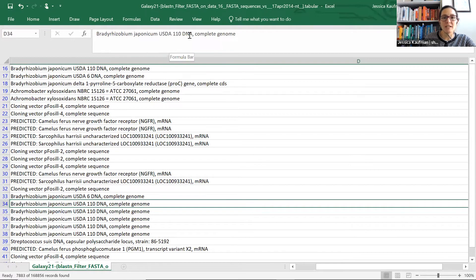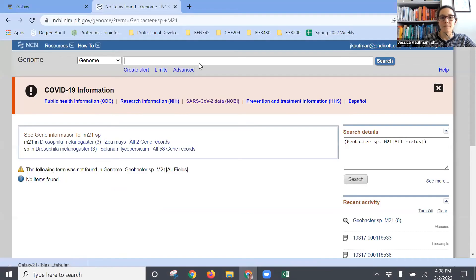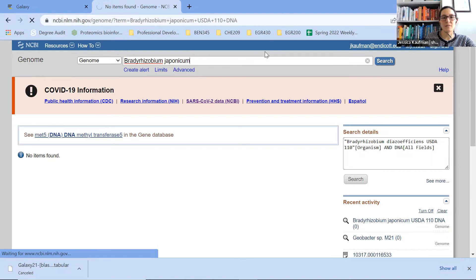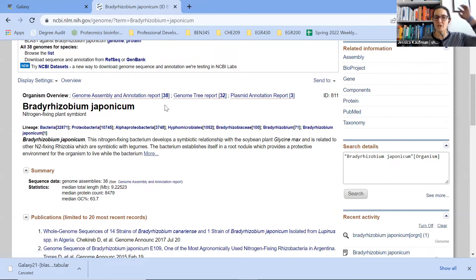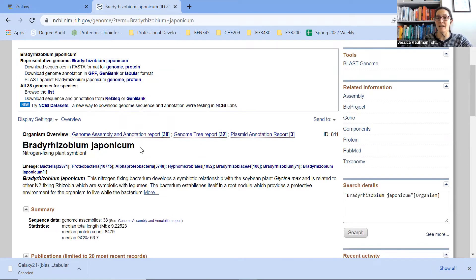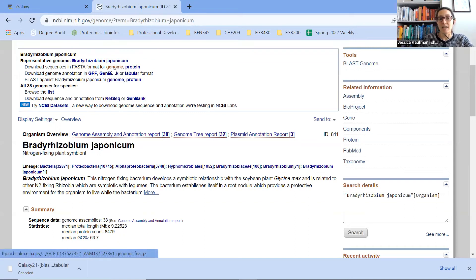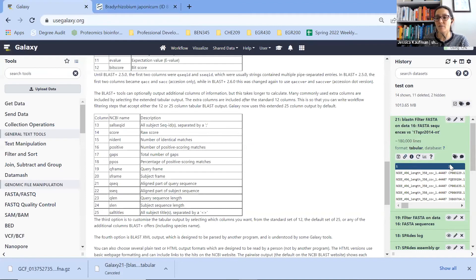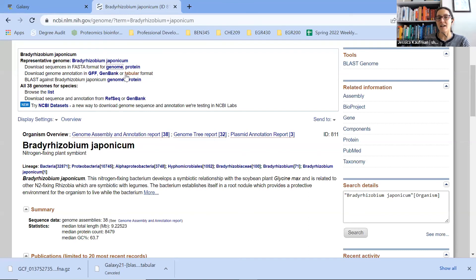This one had a lot of perfect matches, so I think this would be a good one to try to look up. I put a little bit too much information at first, but there we go — so this is a nitrogen-fixing plant symbiont. This is something we should be able to get a genome file and align it to our data. We can get the genome by clicking on this link — the .fna.gz file will download. You don't have to unzip it; you can just directly upload it to Galaxy. I hope this helps you figure out the process for going from a very large BLAST result on Galaxy to identifying a possible reference genome for your microorganism. Thank you.